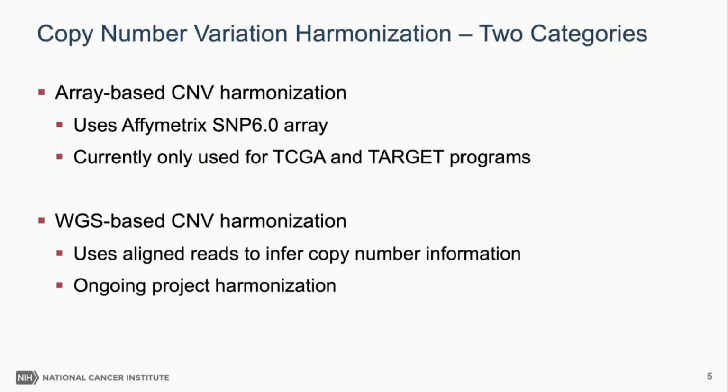And a second reason is that somatic copy number inference is really a very difficult problem, even up to now. Tumor samples vary very widely in purity and ploidy and clonality. So a highly pure tumor with subtle copy number changes can look very similar to a less pure sample with drastic CNV changes. This is why we created several workflows to get the best possible results for everyone who uses the GDC. And I will go through each of these workflows in roughly the order we introduced them in the GDC.